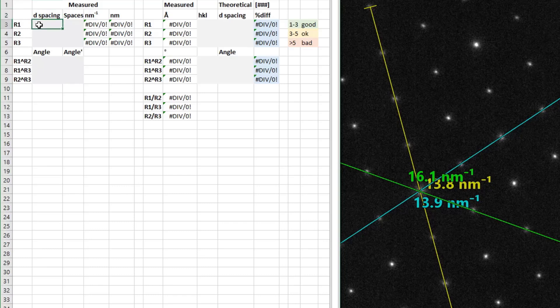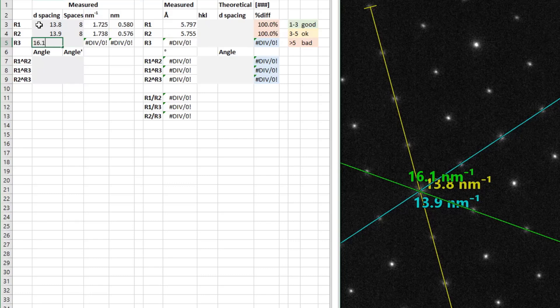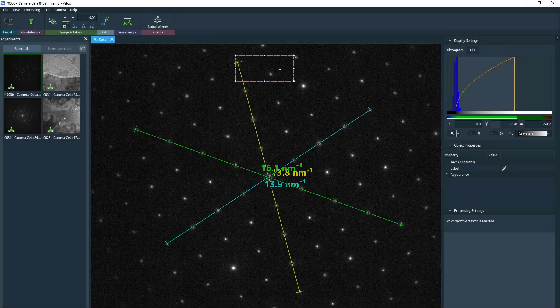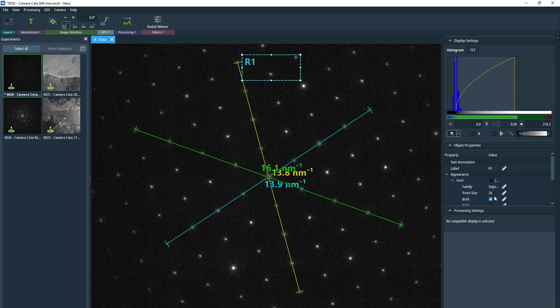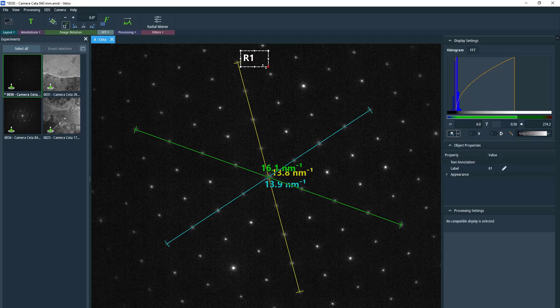So once we have possibilities, I have an Excel spreadsheet that I use to auto-calculate my D-spacings based on the output from VLOX. Because VLOX outputs in inverse nanometers, I have it auto-correct for that. Because I also measure through multiple spots to make it more accurate, I go ahead and average out that or divide by the number of spaces. I'm just typing in the measurements that I had, and then we can type in the theoretical values. Once we have the actual D-spacings, we can then assign these to R1, R2, R3.